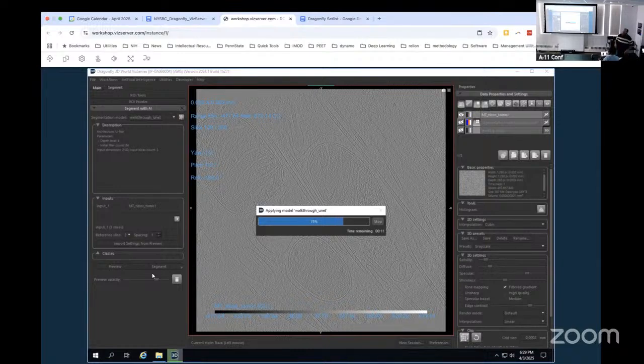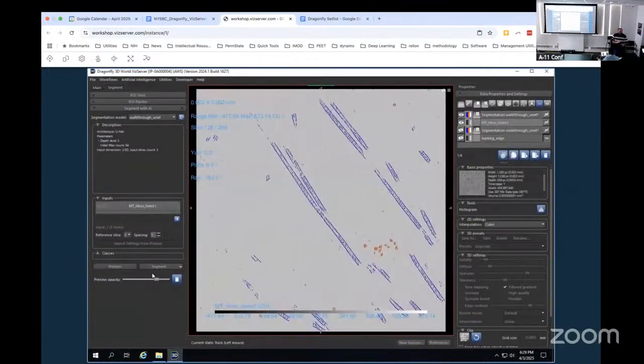Okay. We should check the calibration, but let me also say the network I just used was one that I trained at home that ran for maybe more epochs than yours did. I don't know exactly how yours is going to work. You do have this network on your instance, and we can import it. Let's see if we need to. Did it fail for anyone else? Like did it completely fail to segment anything? Mine's not done loading yet.